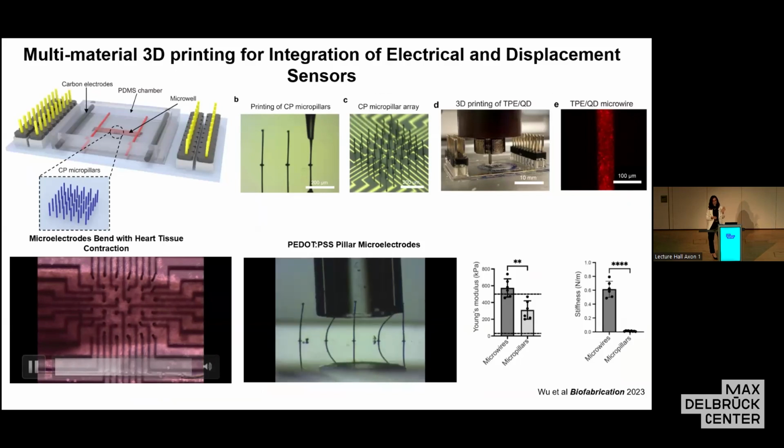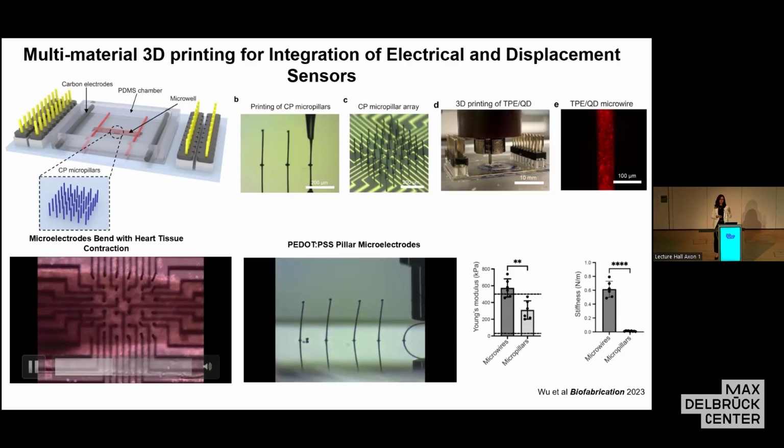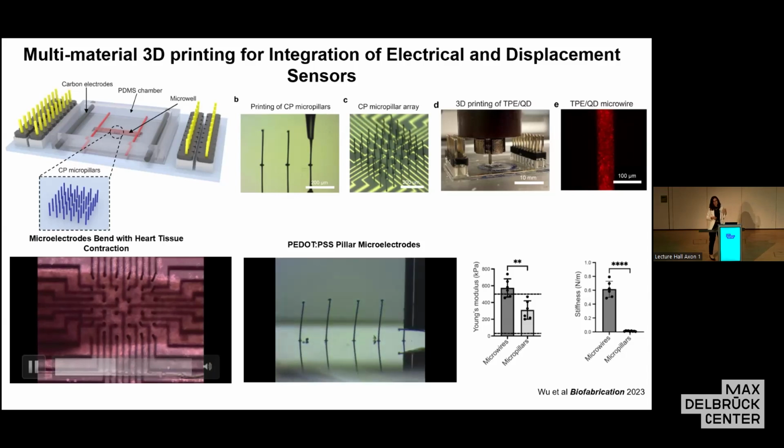So we are definitely not high throughput in the sense of that word that pharma uses, where they screen 20, 30,000 compounds in a period of just a couple of days. We need time, but we are high content. You can get a lot of readouts from one tissue.